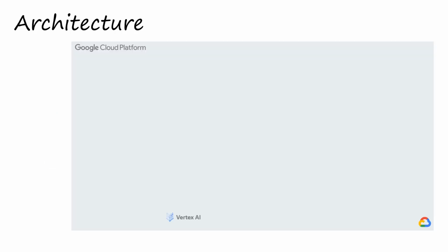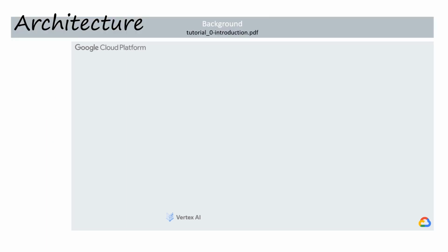Here is a more detailed architecture design. First, we have a scientific background introduction module. This is a document that can be viewed without a Google account. All the other submodules will need the GCP to view and run. Submodules 1 to 3 will be running using Vertex AI Notebook, while submodule 4 will utilize the Google Life Science API for larger datasets, which normally cannot be handled by the Vertex AI.